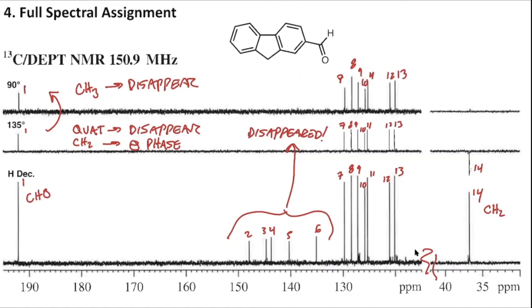Again, as you're coming up with all of these conclusions while working through the data, it wouldn't hurt to continue to make a list. You could say, oh, don't forget about 2, 3, 4, 5, and 6 all must be quaternary, and so on. Make some other observations about whatever else you see, just so that you can keep it in the back of your mind or share it with your lab group.